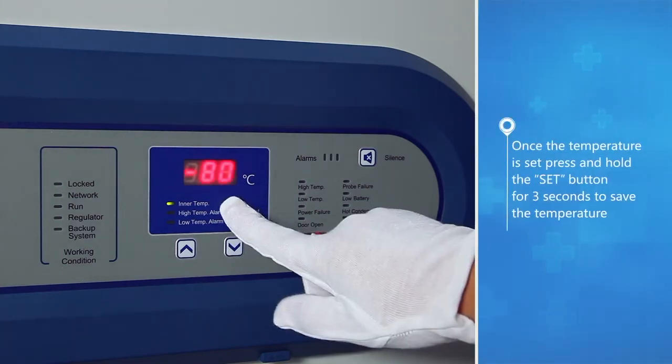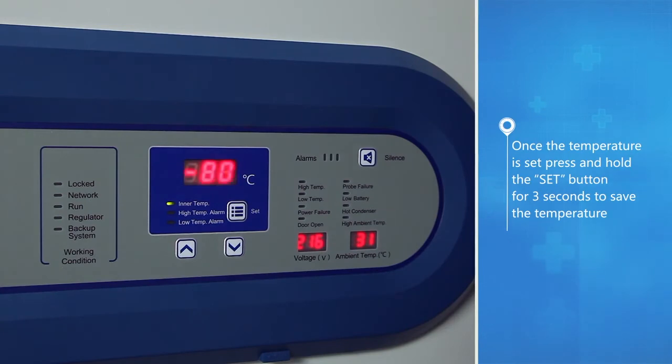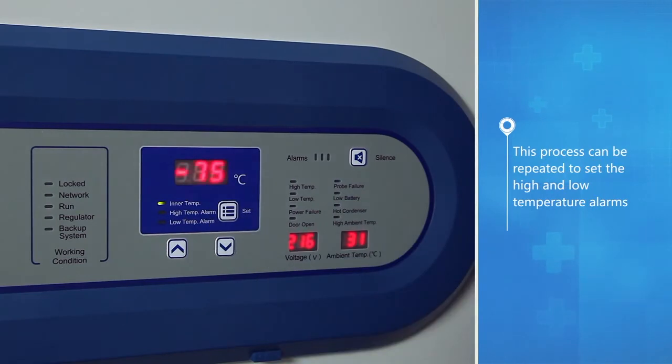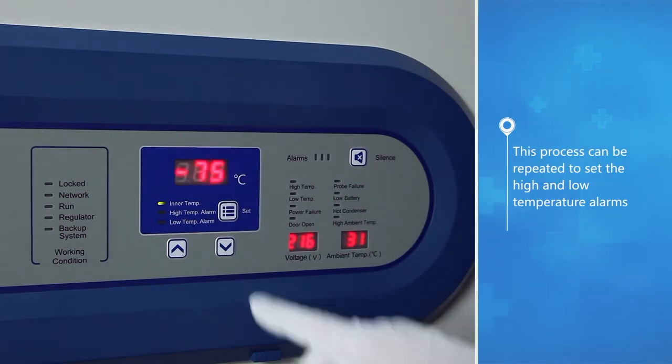Once the temperature is set, press and hold the set button for 3 seconds to save the temperature. This process can be repeated to set the high and low temperature alarms.